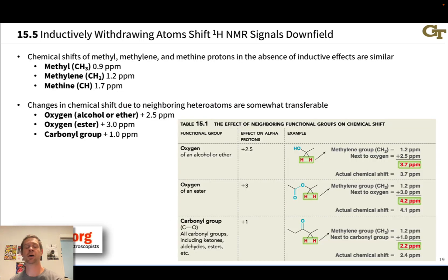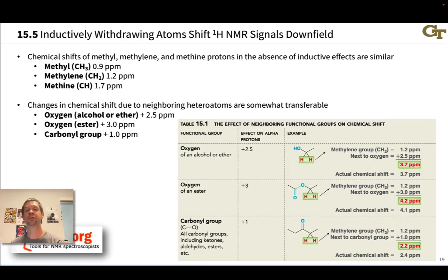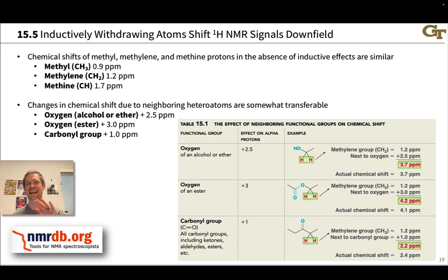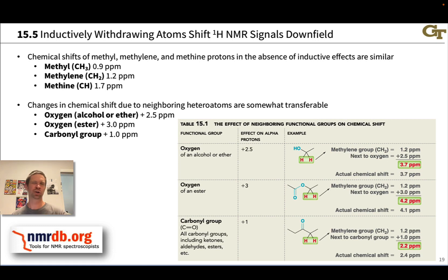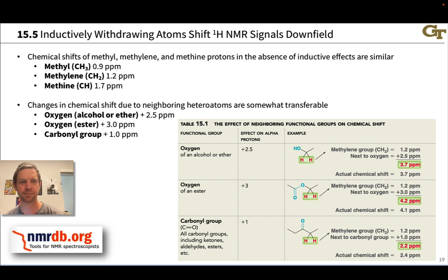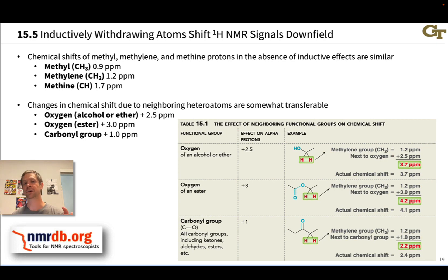Chemical shifts of methyl, CH2, and CH groups in the absence of inductive effects — when these groups are connected only to carbons — are actually pretty similar regardless of the nearby carbon groups: about 0.9 ppm for CH3, 1.2 ppm for CH2, and 1.7 ppm for CH. These numbers make a point about how we can predict NMR spectra, which I'll return to in a moment.